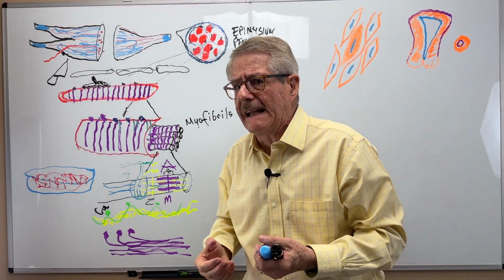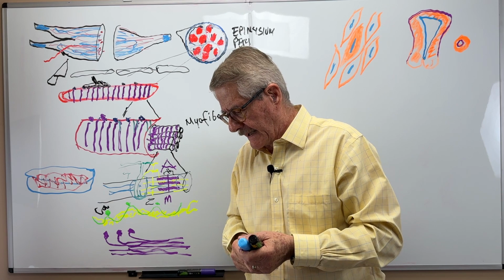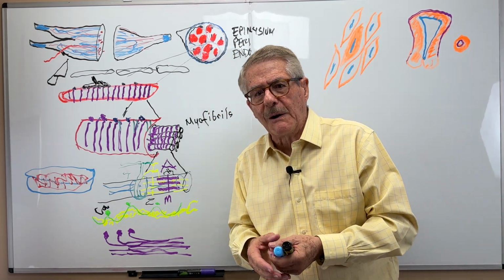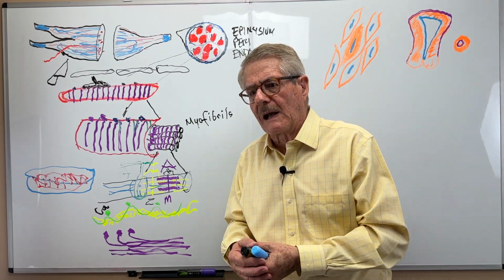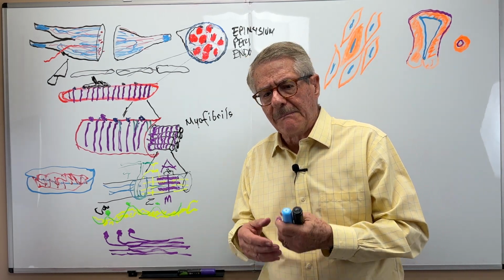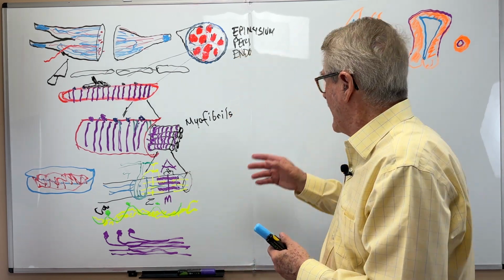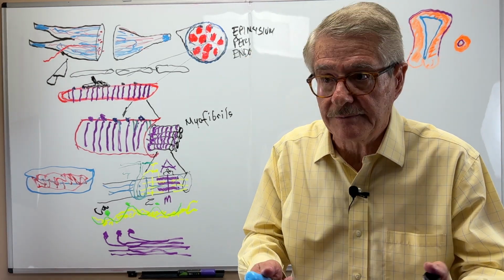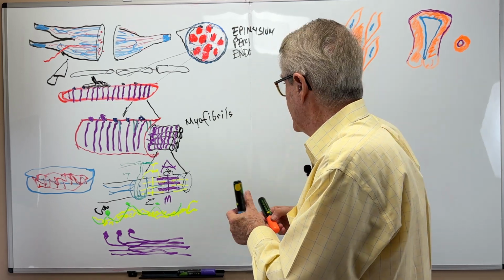The cells don't need the autonomic nerves to tell them when to contract. They contract by themselves by local influences or hormones, but they are also influenced by the parasympathetic. Why is the smooth muscle smooth? Simply, let's try to use this other one.